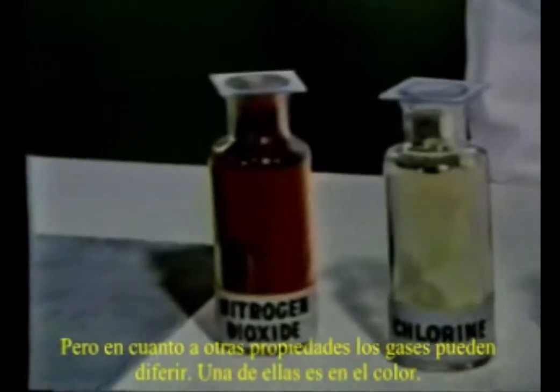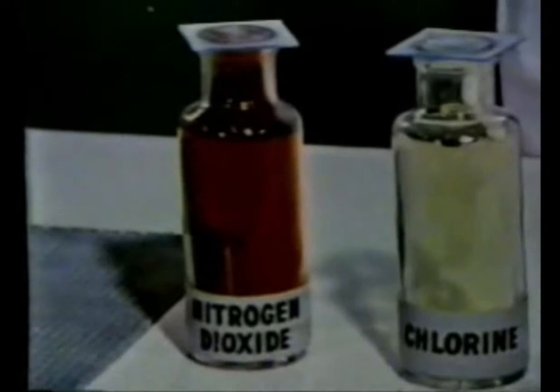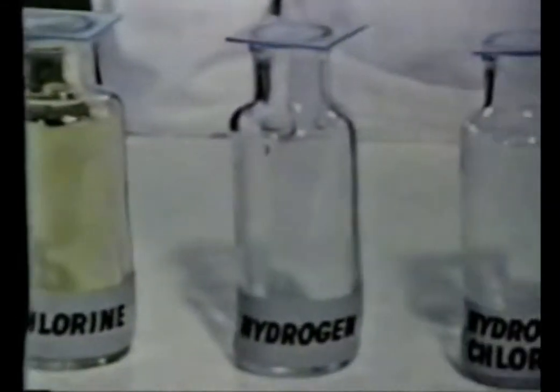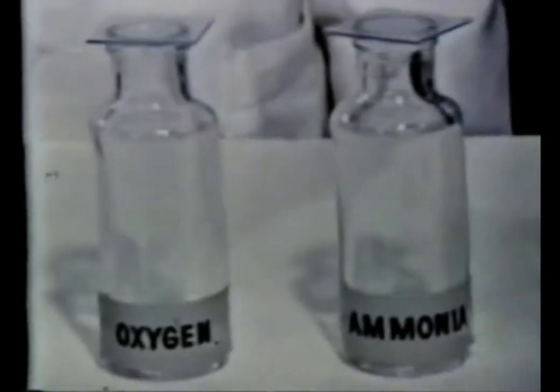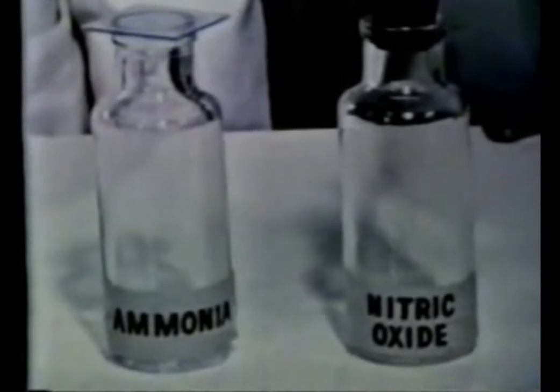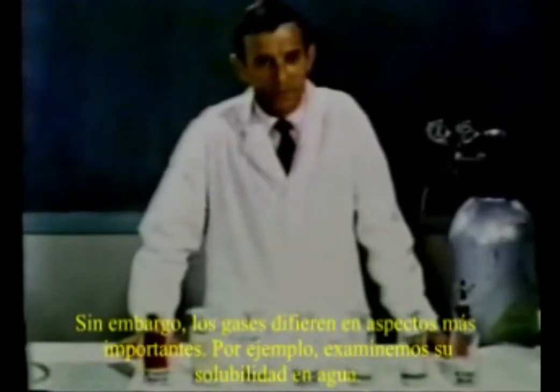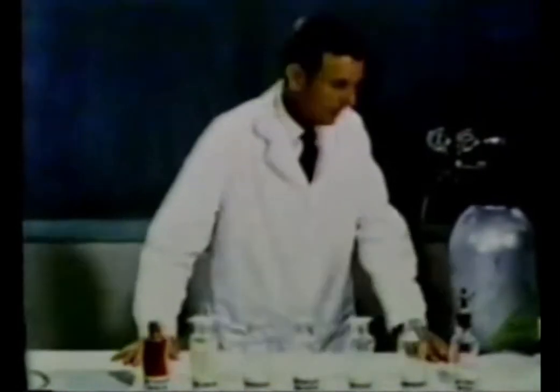An obvious difference is color. This gas called nitrogen dioxide is reddish-brown. Chlorine is pale yellow-green. But most gases are colorless. But gases differ in much more important ways. For example, let's investigate solubility in water.